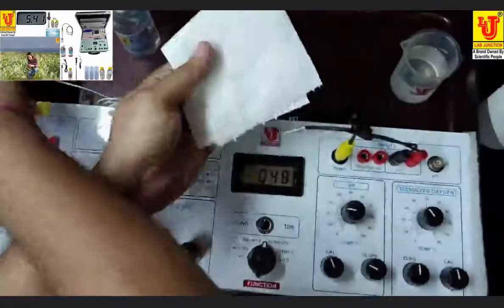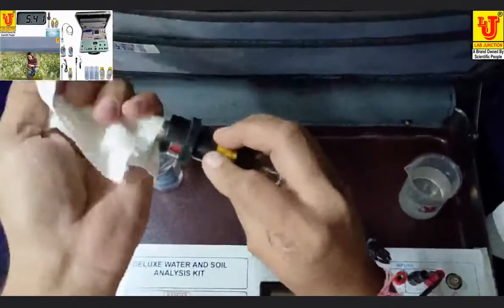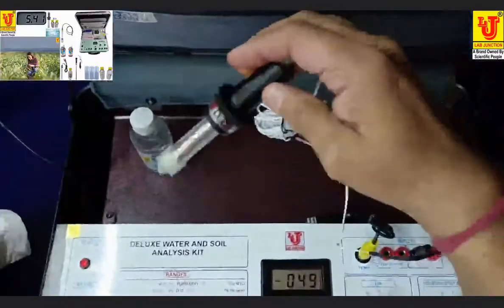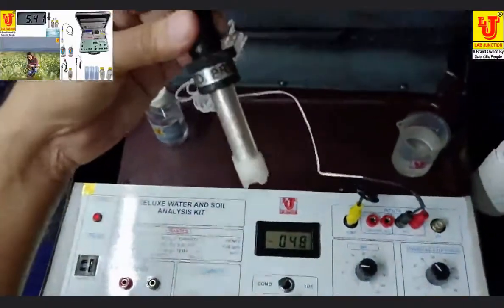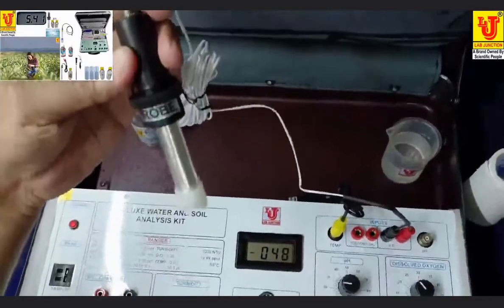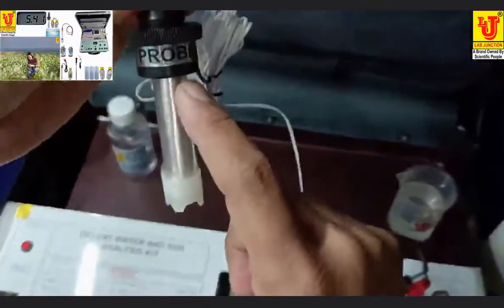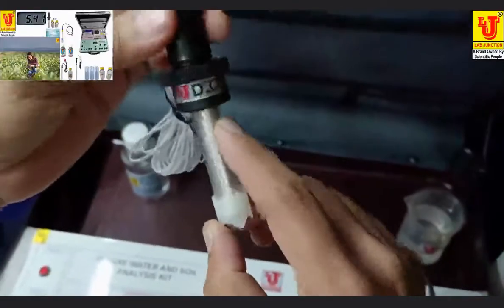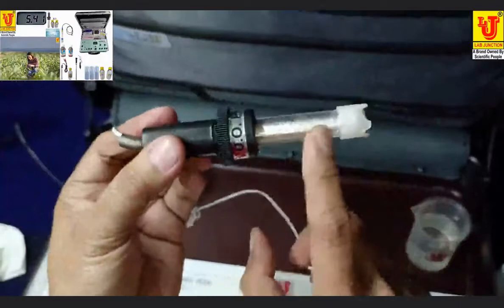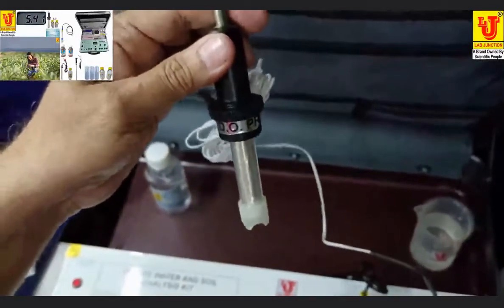Take one tissue paper and refresh this. Now your dissolved oxygen probe cum sensor is ready for use. Please ensure that no air bubble is in the tube. It is of transparent type. Please confirm no air bubble is seen on the inner side of the tube.